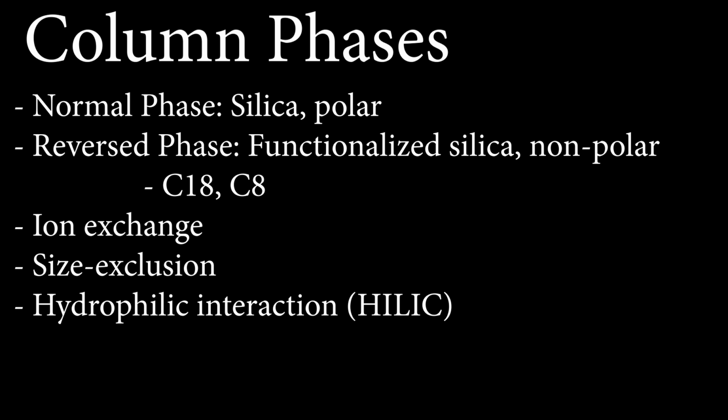In Organic 2, that white column that was in glass, that's going to be silica. Silica is kind of the default for simple, crude organic extractions. What's most common for analytical extractions is actually called reverse phase, with the idea that you have reversed the phase from a polar silica phase to a nonpolar phase. The way that they do that is they functionalize the silica. On the surface of the silica, they attach long, greasy alkane chains.